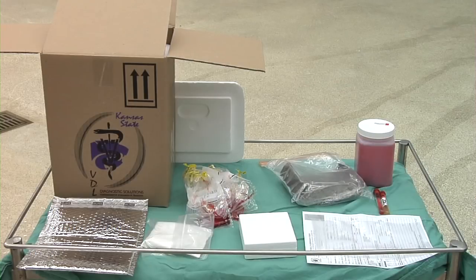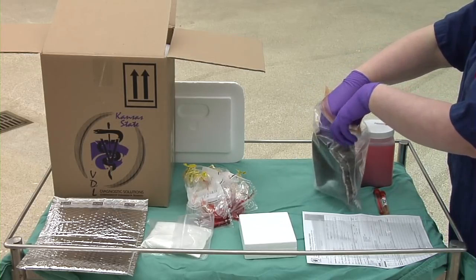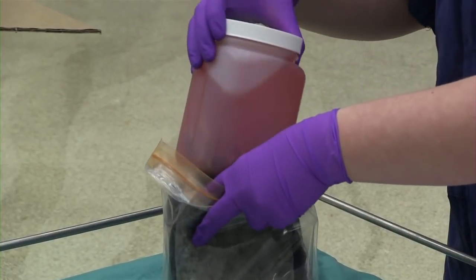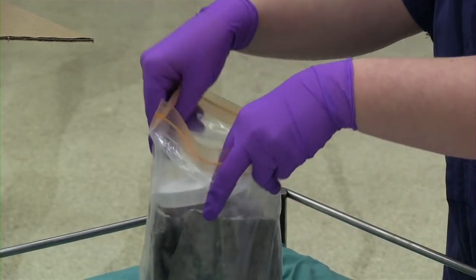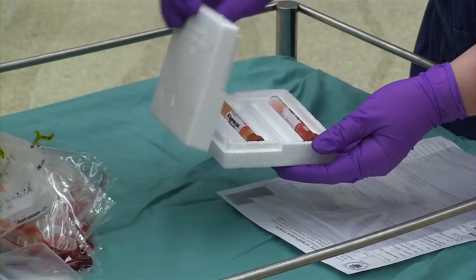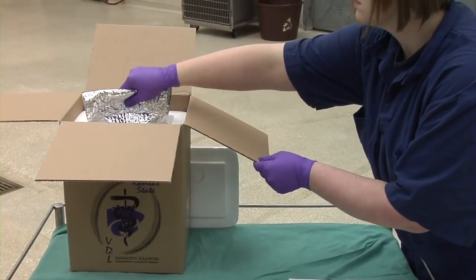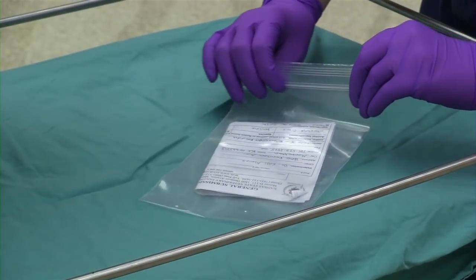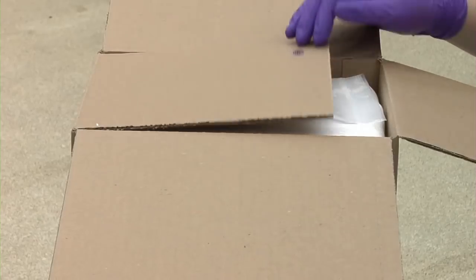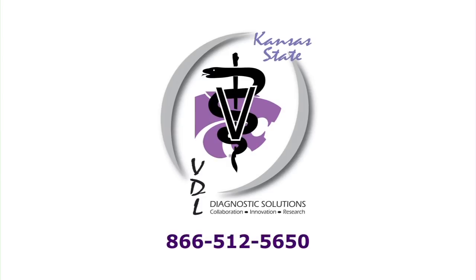After assuring all samples are labeled and the submission form is completed, everything can be packaged for shipment to the lab. This shipment falls under the Category B Infectious Substance Guidelines set forth by the Department of Transportation. These requirements include shipping specimens in a triple packaging manner. The formalin container with the fixed tissue needs to be placed in a secondary container with absorbent material in between. Tubes should be properly cushioned to prevent breakage in transit. Fresh tissues should be refrigerated, not frozen, and set with ice packs. All specimens should be placed inside a cooler and the submission form should be placed inside a Ziploc bag to prevent contamination or moisture accumulation during shipment. The necropsy field kit shown in this video can be ordered by calling the Kansas State Veterinary Diagnostic Laboratory at 866-512-5650. Overnight shipment is recommended to assure samples are in the best condition possible when they reach the lab.